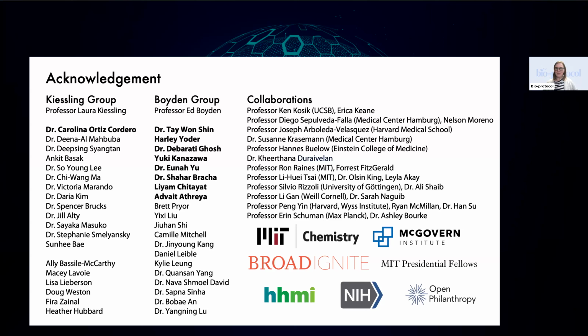Cool, thank you. How good are these gels if you want to use a vibratome sectioning on them with tissue inside? Yeah, so we haven't tested vibratome. I think other expansion protocols have reported using cryostat to section the gel, and I would recommend looking at those studies. My experience is usually these gels are not really thick.